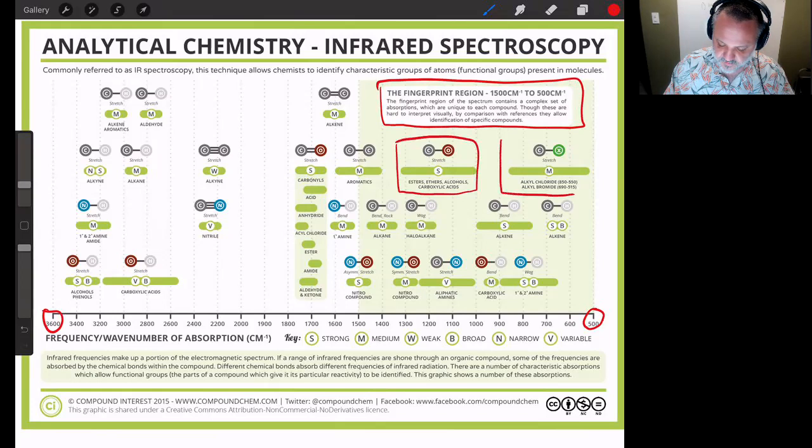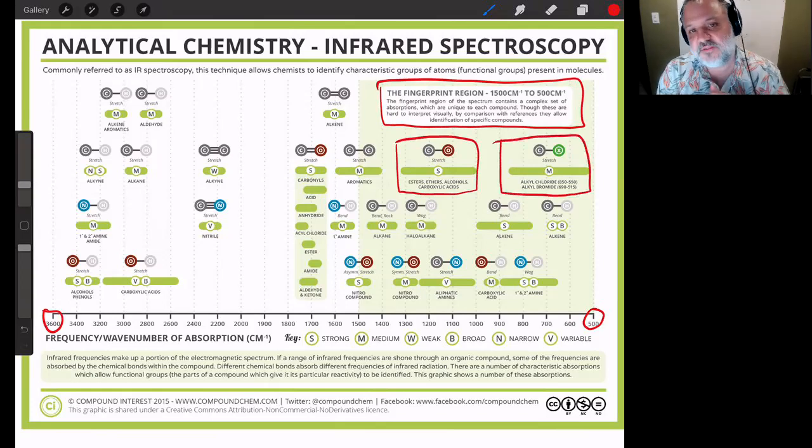Some of the things in these areas you can look for if you think that you have it, like CO stretches and bond vibrations that involve carbons and halogens. But some of the other things are not going to be particularly useful, right? So if you have an oxygen connected to a carbon, and it's only connected by single bonds, you might be able to see it, but it's going to be buried underneath some of these other signals. Maybe you'll be able to resolve it, maybe you won't. Generally, in my experience, carbon-oxygen bonds are resolvable. Some of the other bonds aren't particularly resolvable.